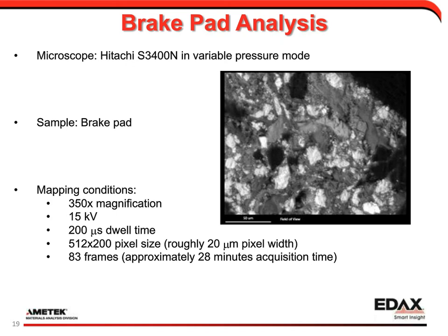So if you go to low acceleration voltages, you can see some effects of the beam spot size. But generally at high acceleration voltages, you're limited by your X-ray interaction volume and not the beam size, the sharpness of the image.